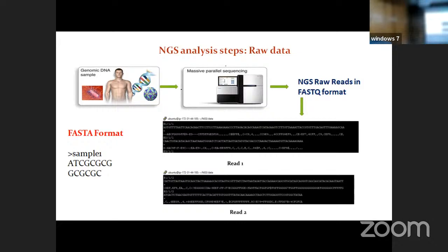Then those 10 errors might be variants, all wrong, right? So in NGS data, the very first step is to analyze the raw reads to perform quality control, such that we are going to take the bases having accuracy greater than 99.9%.